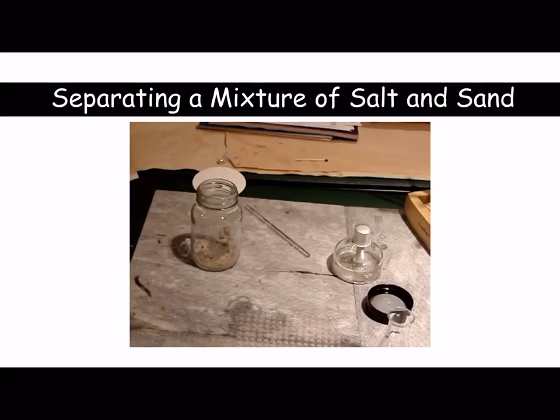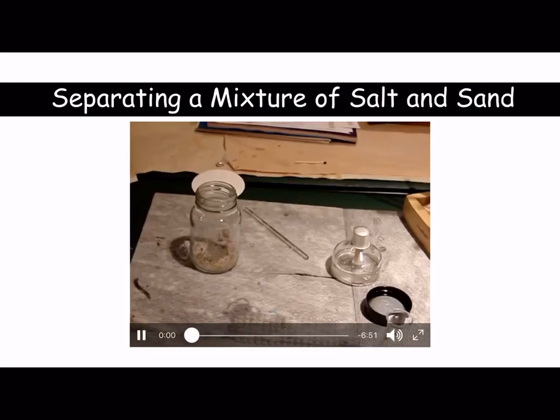So we're going to have a look today at separating a mixture of sand and salt. So if we've sand and salt in a container, we are going to have a look at how to separate that. Now this is just a very simple setup that you could actually do at home. Please don't. So we're going to talk you through that.